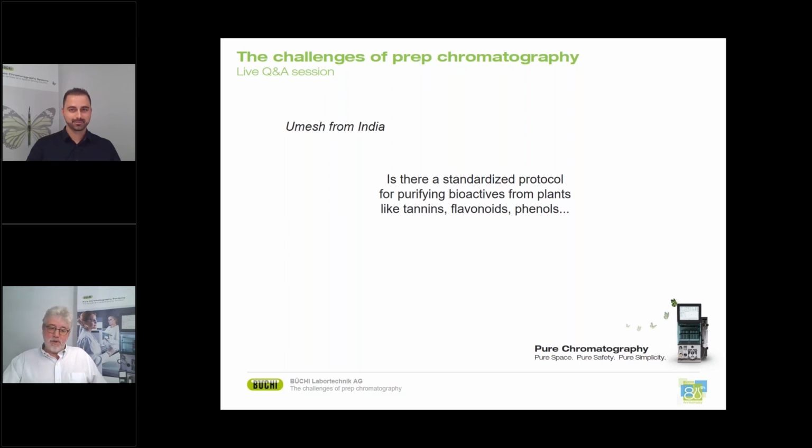I think I have to come back again on what I said earlier. Plant extracts are very complex samples. Also, we know that the plant itself is various as well. So that means the sample or the extract you get is in many cases very different.